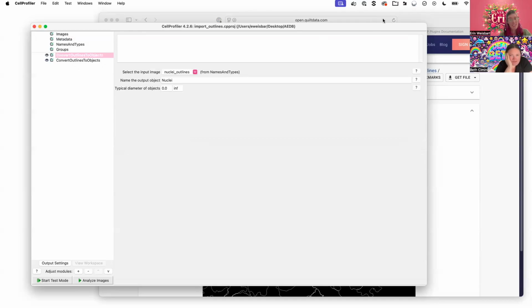So we already have another Ask Erin Dear Beth episode about CellProfiler plugins. So go check that out for more information about CellProfiler plugins, how to use them, how to find them. We'll add it to the show notes. The link, yeah. So go check that out if you're not familiar with the CellProfiler plugins system. But this is a plugin that is available in our repo, and the plugin is called Convert Outlines to Objects. And so quite handily, what it does is converts outlines to objects. Go figure.